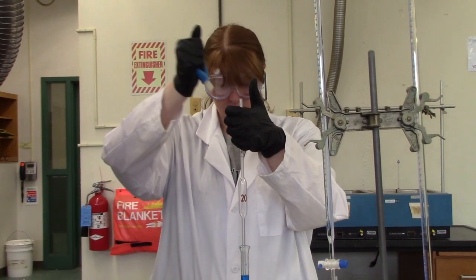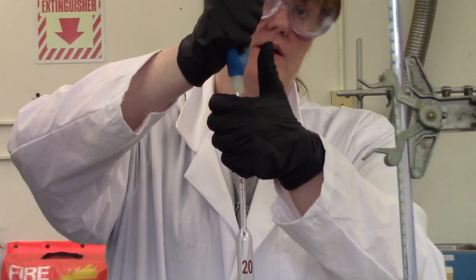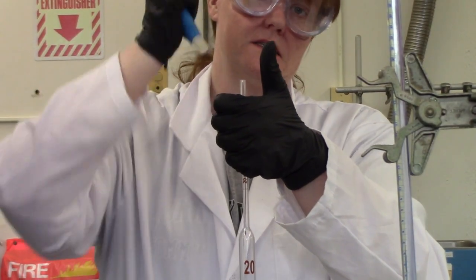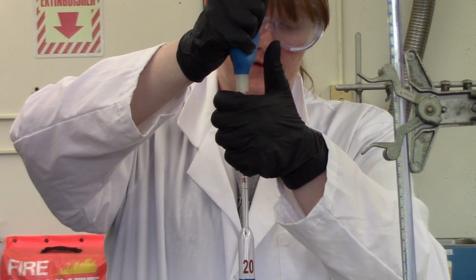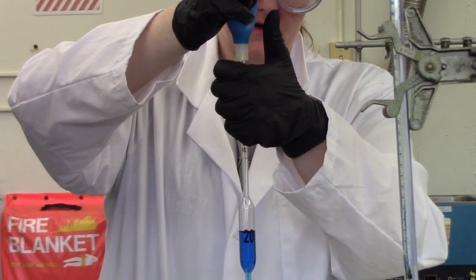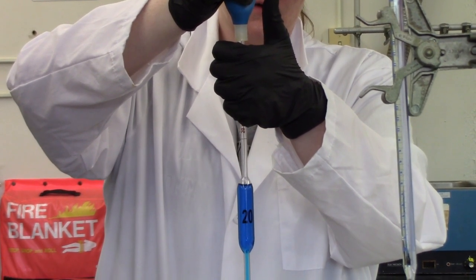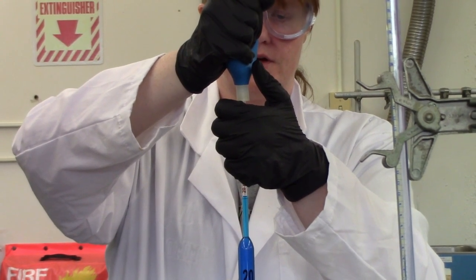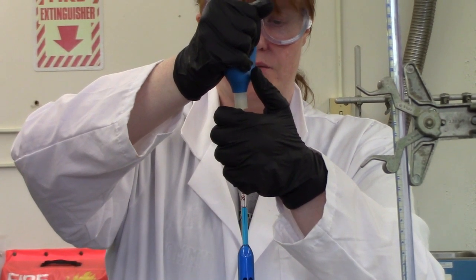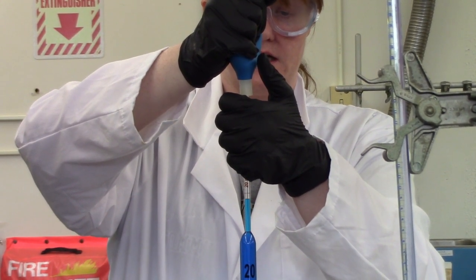So what we're going to do, submerge it, gently place the aspirator on top here. You're not jamming it down. It doesn't stay on permanently, you're just holding it. And this will suck up the fluid for you. You have to keep an eye on the fluid level in the flask so you don't suck up air, because that can mess it up. You can control the speed by pressing the bulb. Right now I'm pushing it a little bit. Now I'm letting it go a little bit.